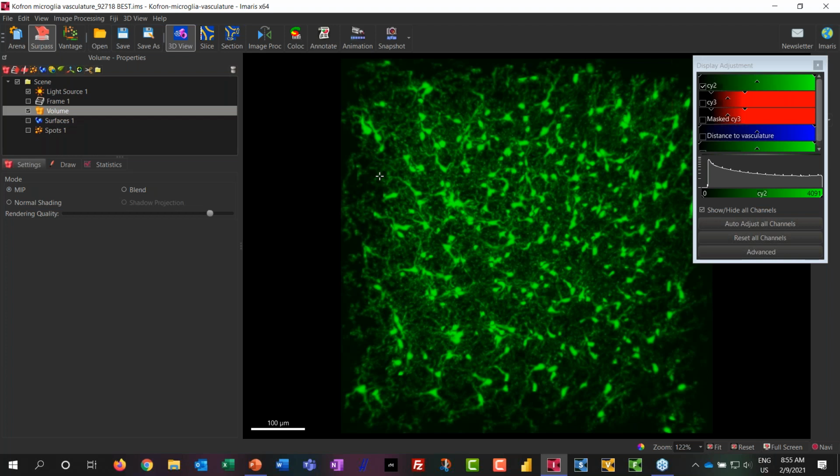Now, this is one of those cases where I do expect a lot of feedback from customers about the spatial stats plot and what we've included and what we haven't included. So definitely tell us what would be useful for you. Let your supporters and salespeople know. And yeah, we'll see where we go from here. Okay. All right, thank you.